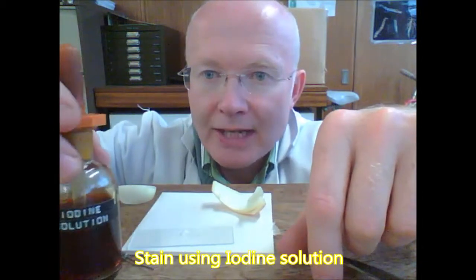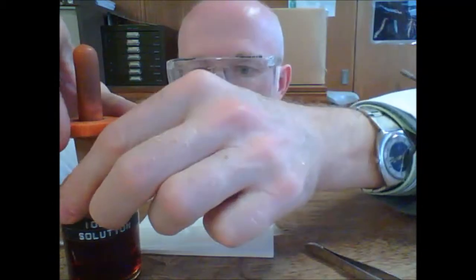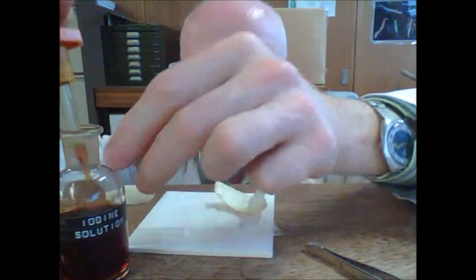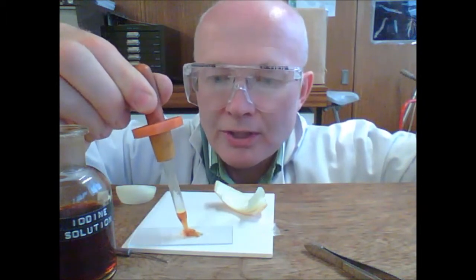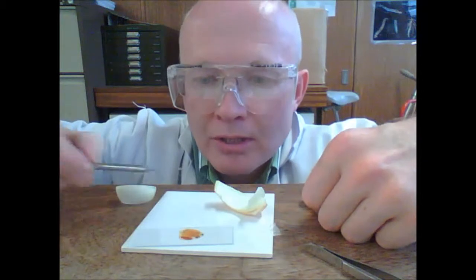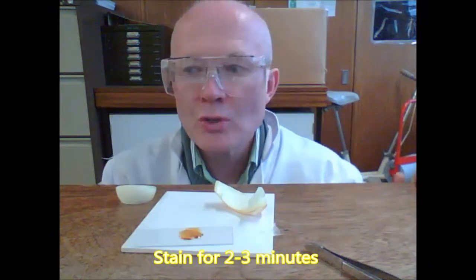Then we need to stain the tissue. We stain it with iodine solution. To stain, you must wear eye protection. So I'll loosen the jar, take out a couple of drops, and then place it on the tissue. Make sure you cover the tissue with the iodine — enough to cover. If the iodine does not go onto the tissue, because the tissue is quite repellent, water repellent, you can use a mounted needle just to make sure that it's fully covered. You need to leave that for two to three minutes.